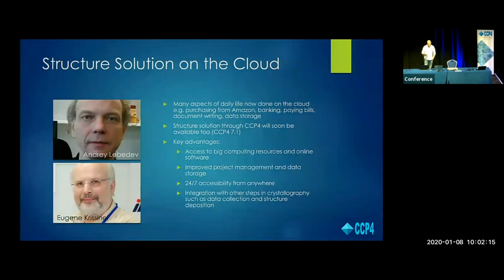Well, CCP4 Cloud takes things to the next level, where it includes project management for your structure solution. So it has a nice way of viewing what you've done, which I'll demonstrate.